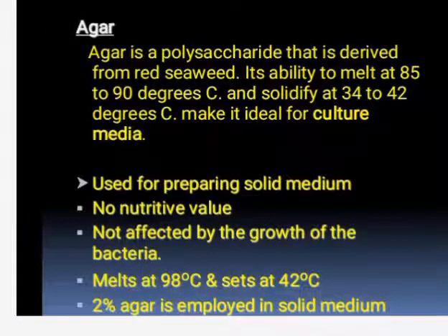Now there is another important question: what is agar? Agar is a polysaccharide that is derived from red seaweed. Its ability to melt at 85 to 90 degrees Celsius and solidify at 34 to 42 degrees Celsius makes it ideal for culture media. It is used for preparing solid medium.